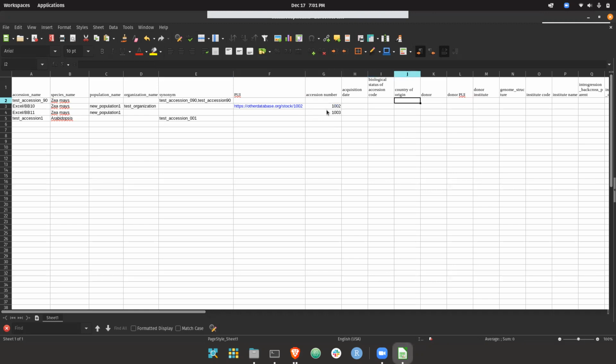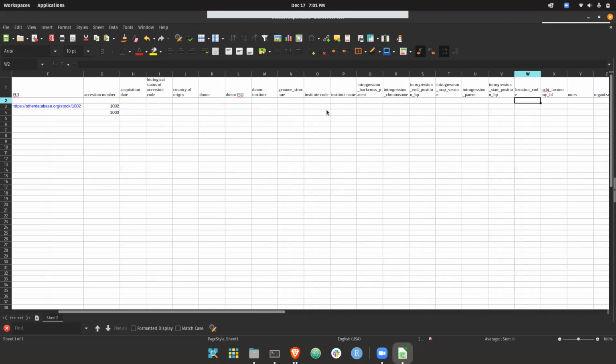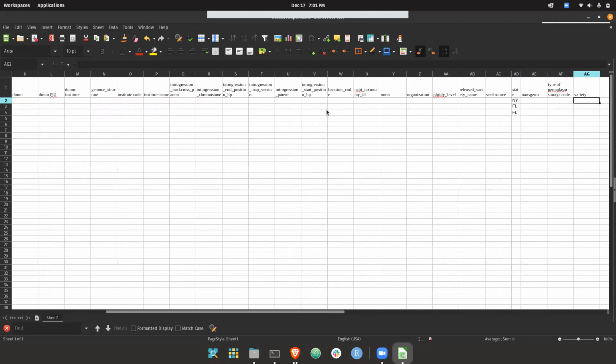And we have a number of columns here, and I've just included state. So these columns are actually defined in the configuration file. It's just a list of attributes in the sgn.conf file, so you can add your own attributes easily through that configuration.